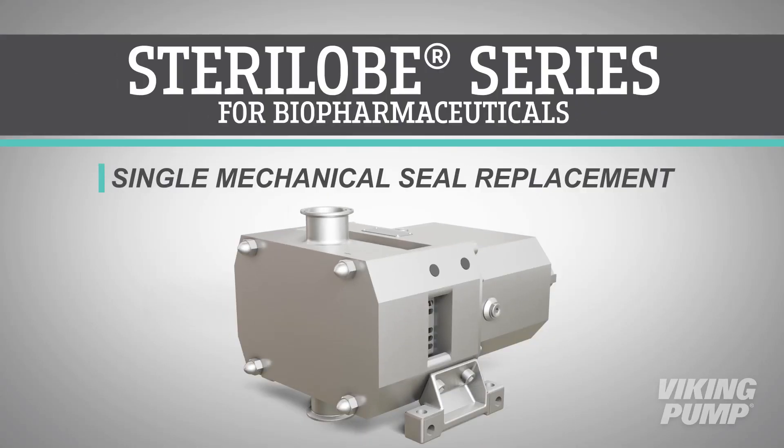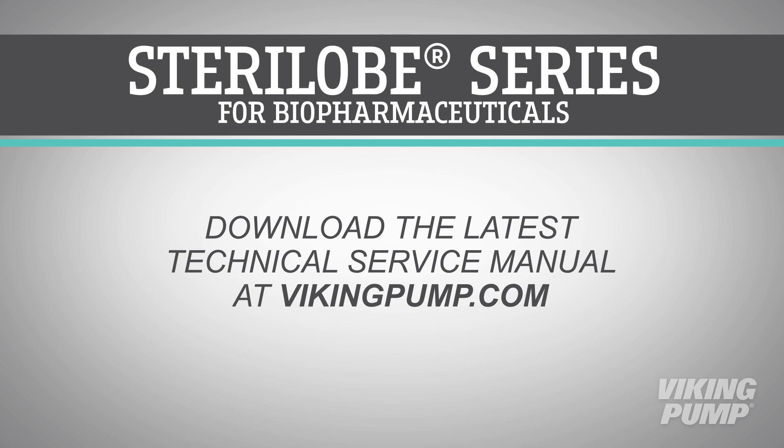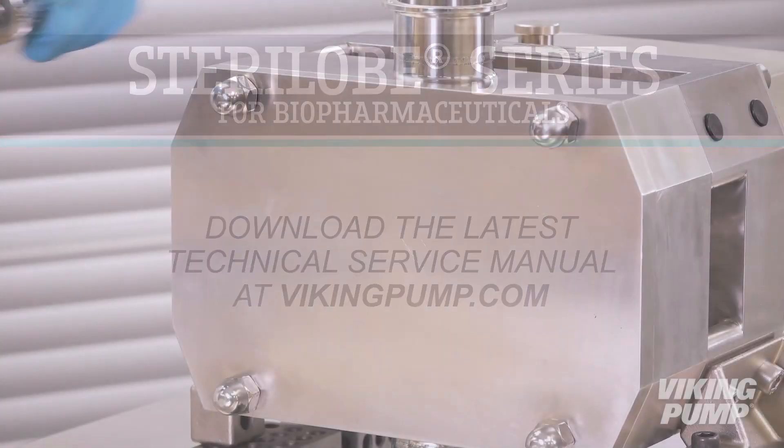Welcome. In this video, we will guide you through the basic disassembly, replacement of single seals, and reassembly of a Viking Pump vertically ported sterile lobe series for biopharmaceutical processes. Before you begin, please consult the appropriate technical service manual for safety information. A copy of the latest revision can be found on our website at vikingpump.com.